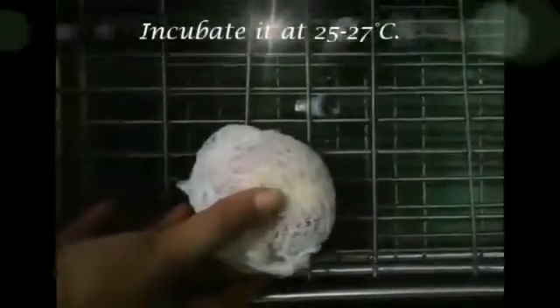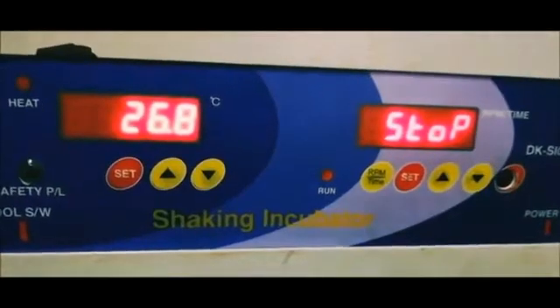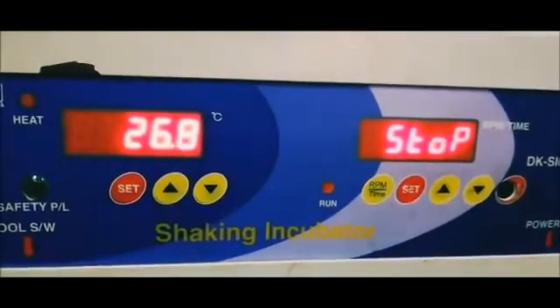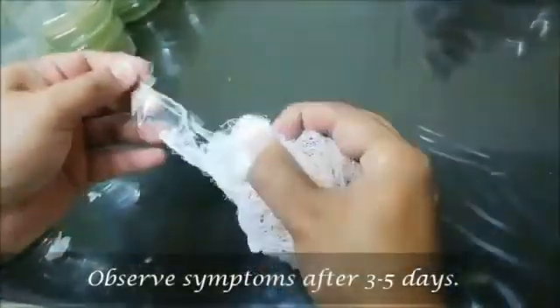Incubate it at 25 to 27 degrees centigrade. Observe the symptoms after 3 to 5 days of inoculation.